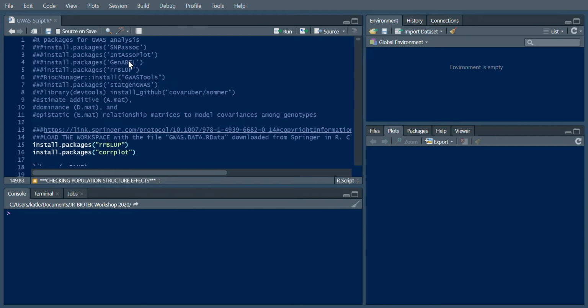My name is Catherine Danmaigona Clement, and I will be taking you through the tutorial for this section. By way of introduction, I would like to let you know that there are other platforms aside from R that you could use to analyze your GWAS data. You could use the command line and some Python scripts and some software that only works with Linux. But for this workshop, we are focusing on R.